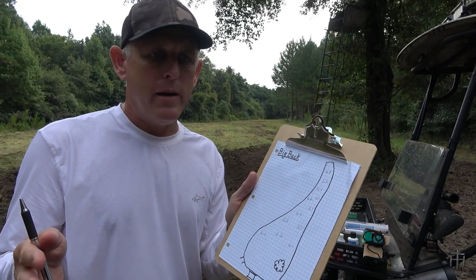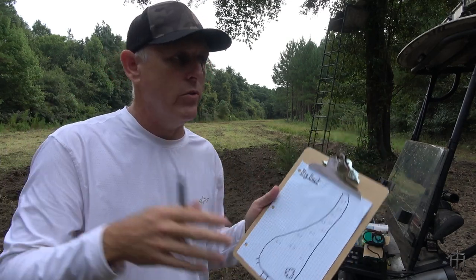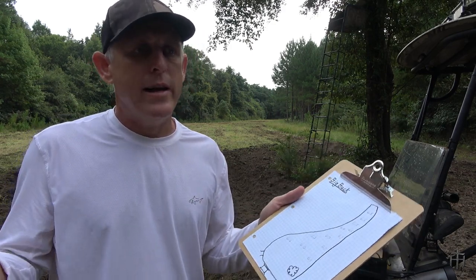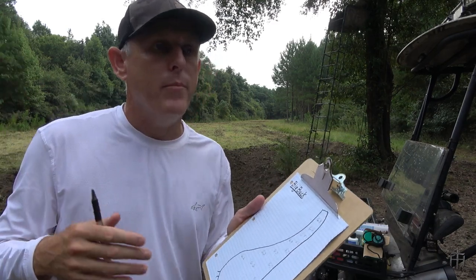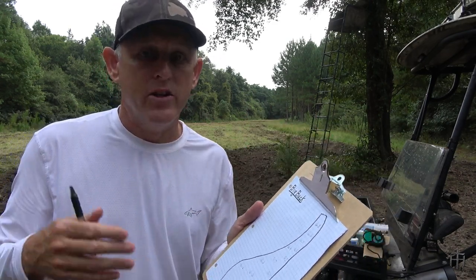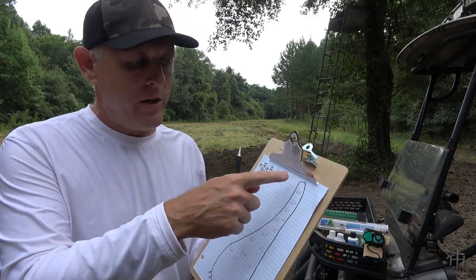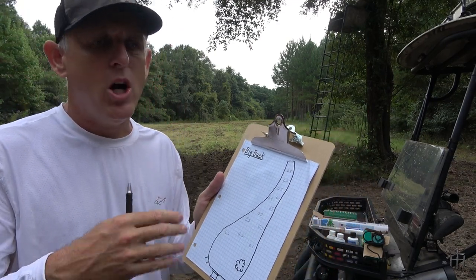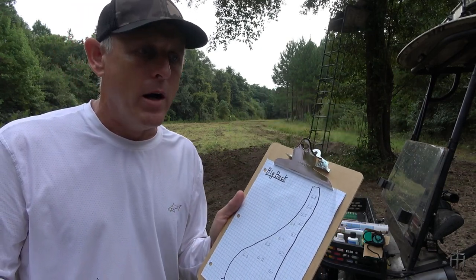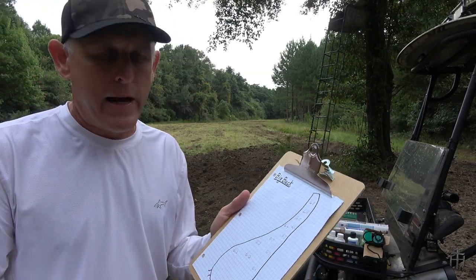Where a pen like this will save you money is: when you start a food plot, you're obviously going to want to get a full spectrum soil analysis sent off to a university. But after that, say your soil analysis says you need lime — you put lime out and want to monitor whether your pH is going up. It's nice to not have to send in more samples. You can just quickly run through your food plots with a soil pen, check your pH, and see if it's moving up. You can also run a hundred probes on this food plot to find exactly where your lowest points are, so you know where to concentrate your lime money.